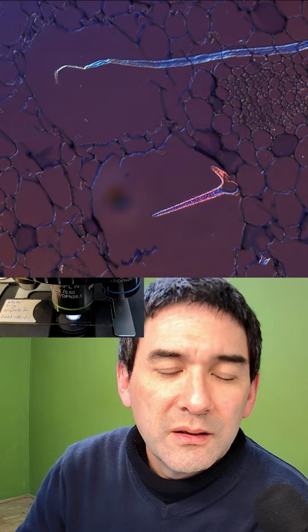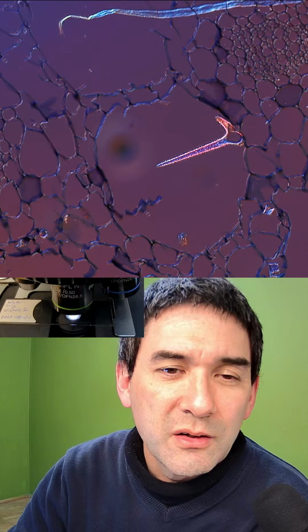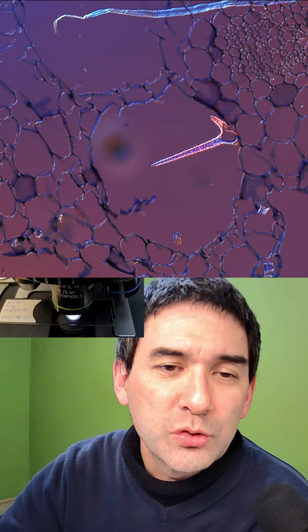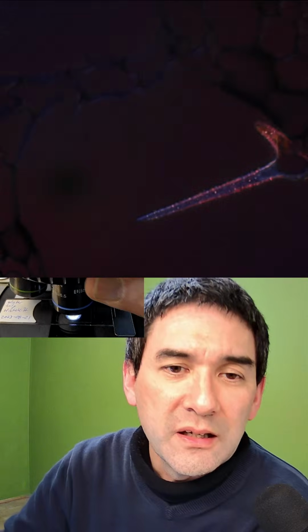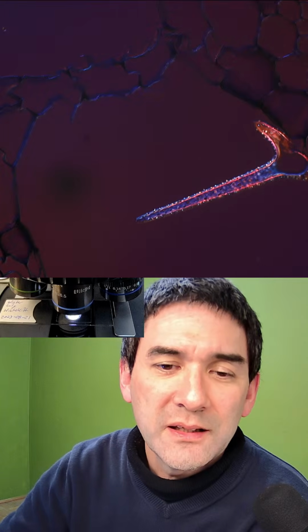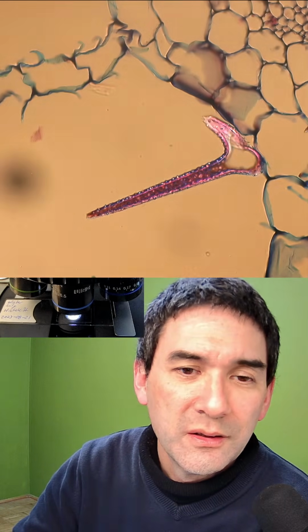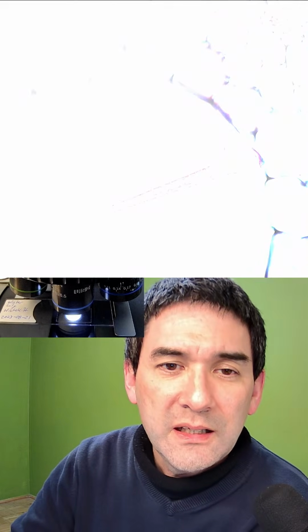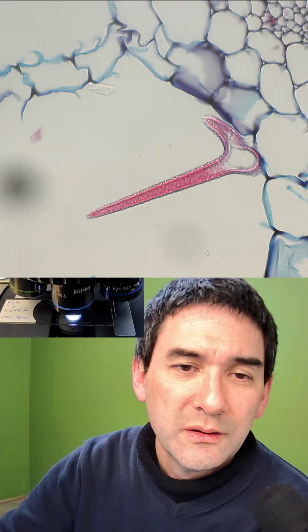Okay. Look at this. Do you see this spike thing here? These seem to be calcium oxalate crystals inside the water lily. Very typical. And look, because I'm using polarized light now, look how nicely they shine. Basically, without any polarization, this is how they look like in bright field.